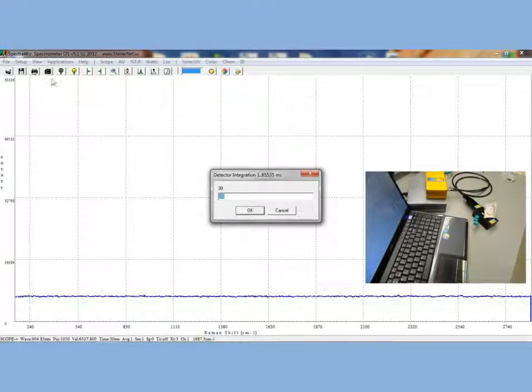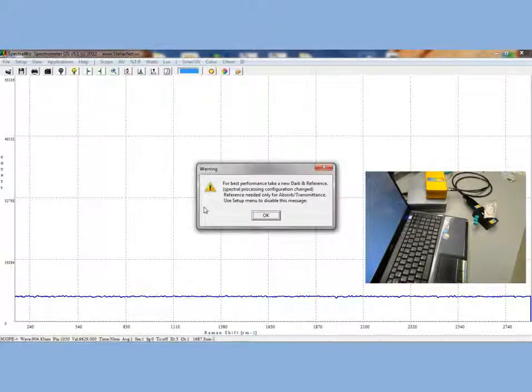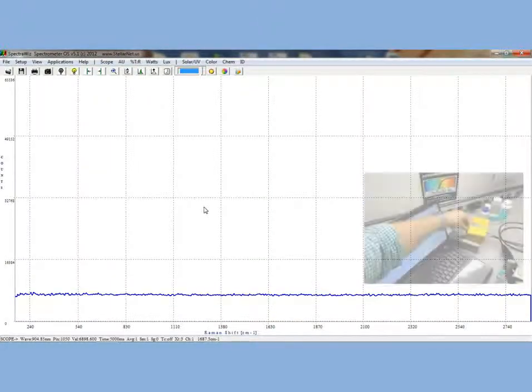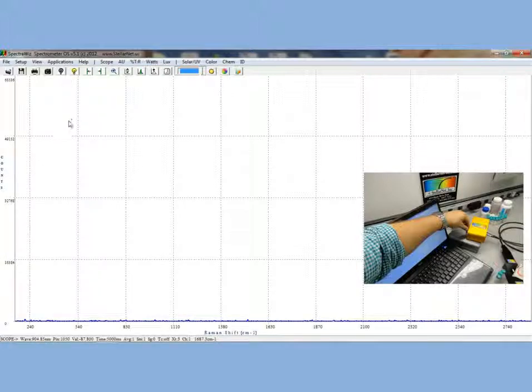Now we will adjust our detector integration time. Since we are looking at low-level light from the Raman scatter, we will have to increase our detector integration time. Once you have set your integration time, you must take a dark reference spectrum. You do this by clicking on the dark lightbulb icon on the top of the screen. You will see your baseline fall to zero.